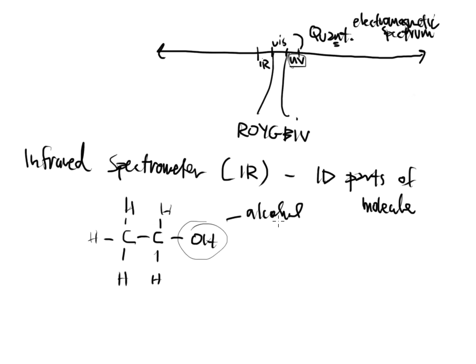And maybe another group on a molecule, it loves cardio. And another group on the molecule, it loves leg day. Okay, well, different molecules behave a different way, depending on what's on there. But they still show up to work out. They just prefer to work out a certain way every single time. And OH will do that in infrared spectroscopy.